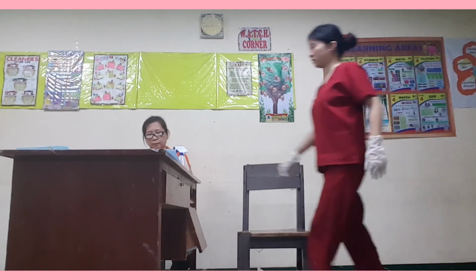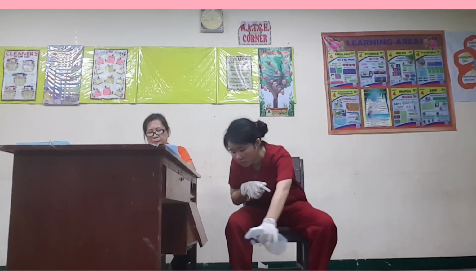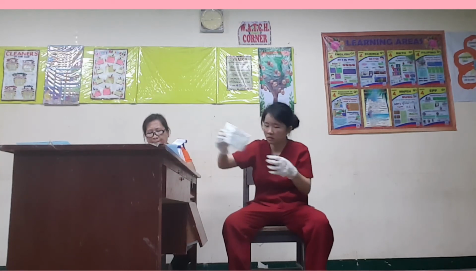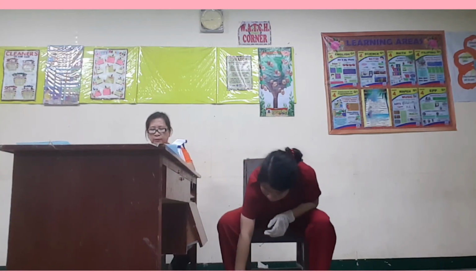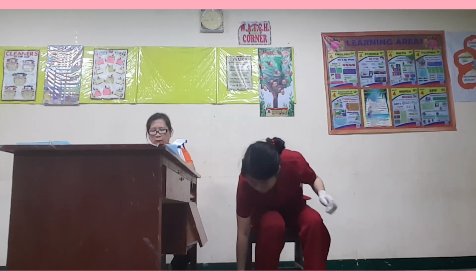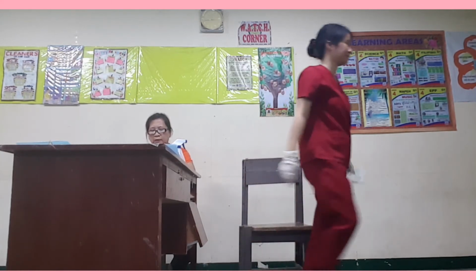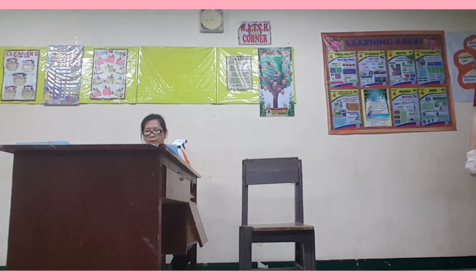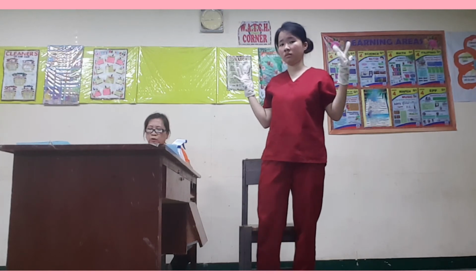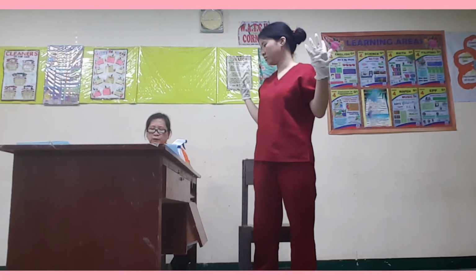Disinfect the other boot following the same steps and using a new 1:10 bleach disinfectant wipe. Set down the other newly cleaned boot in the low-risk area. Discard the 1:10 bleach disinfectant wipe. This removes microbial pathogens and prevents the transmission of disease and illness, and sanitizes before disposing of it.